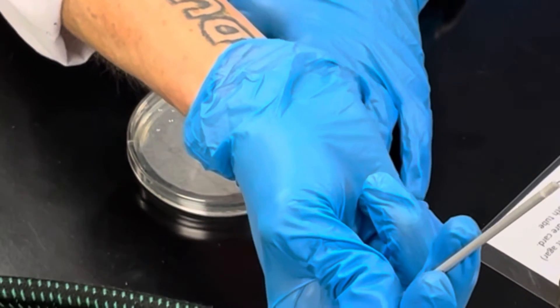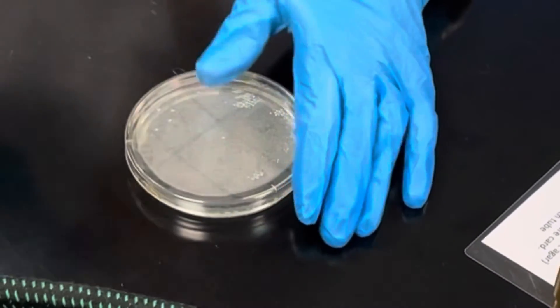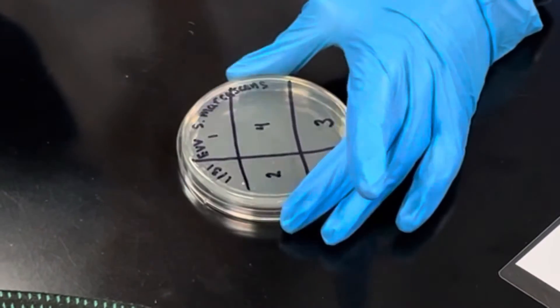Close your plate, sterilize your loop by flaming from the base to the tip, then flip your plate upside down. This plate is now ready for incubation.